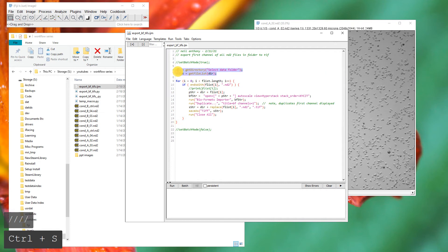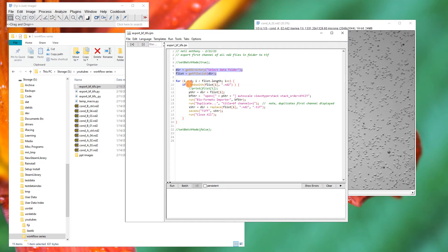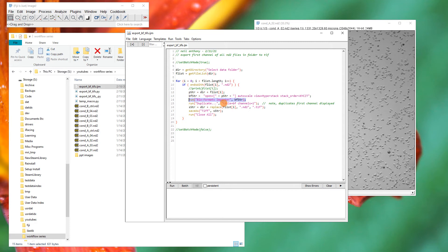Let's run through what the macro does in the different steps. First, we get the directory — a dialog pops up, which is then turned into a list. That list is used in a for loop, and for each item in the list it checks if the file ends with .nd2. If it does, it does some string work to create a path string from the directory and each list item. That path string is put into a Bio-Formats string, which is fed into the Bio-Formats function to open the file. Once open, we duplicate just channel 1, do more string work to replace the extension with .tiff, then save and close the windows and repeat.